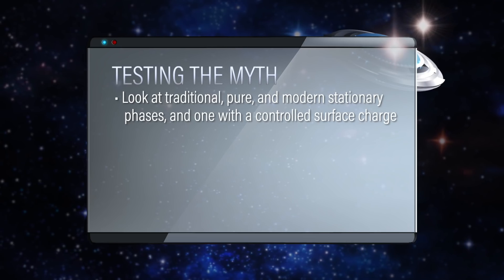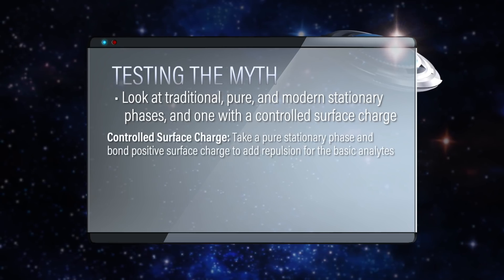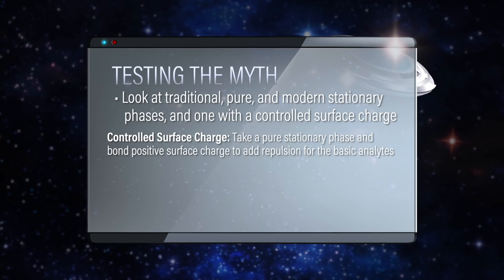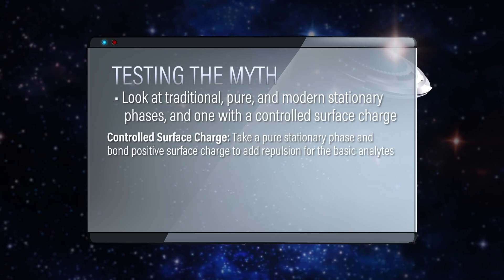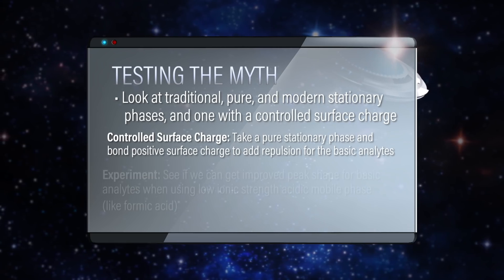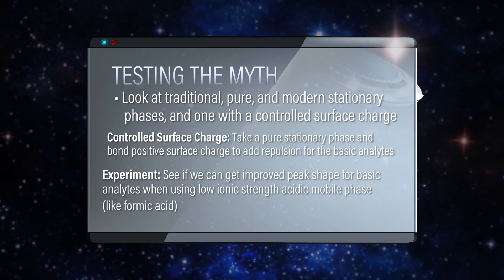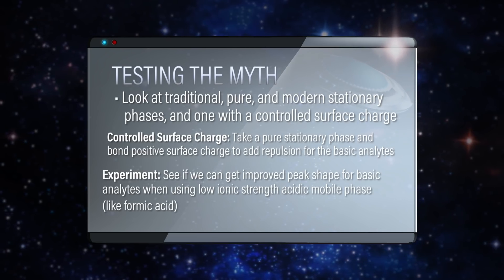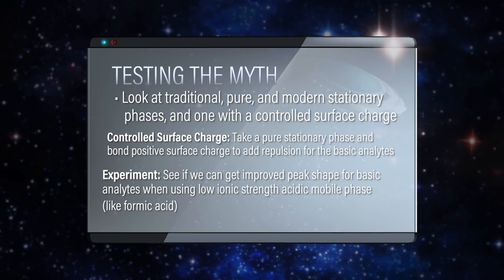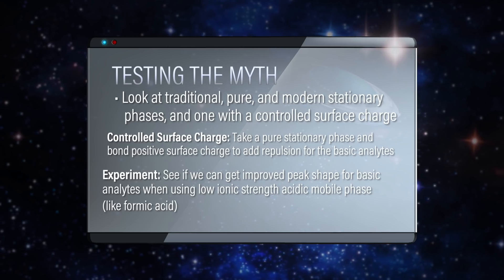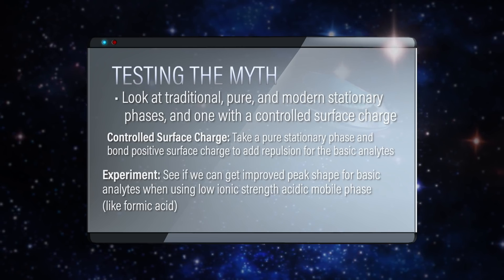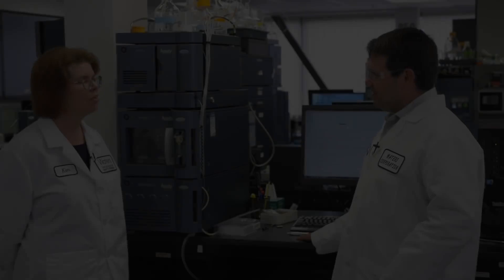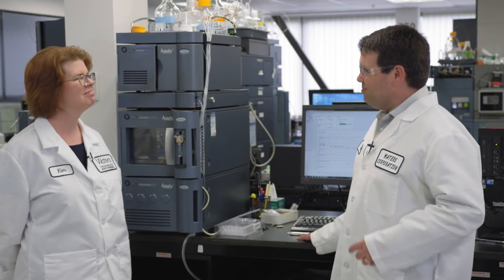What's a controlled surface charge? A controlled surface charge is where you take a pure stationary phase and you actually bond down to the surface a little bit of a positive surface charge, to actually add some repulsion for those basic analytes. We'll see if we can get improved peak shape for those basic analytes when using a low ionic strength acidic mobile phase like formic acid. Okay, let's do it — let's run it.